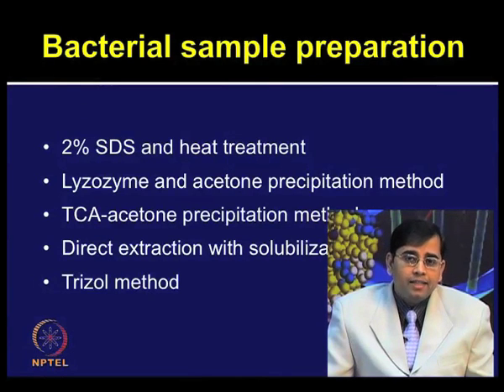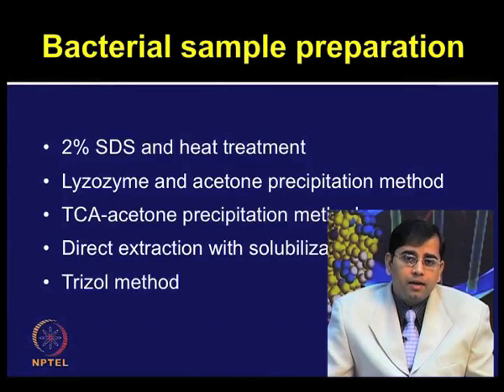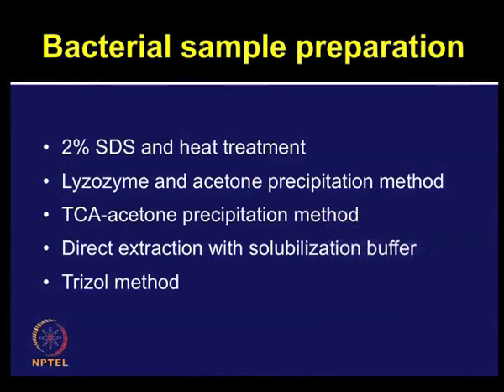Trichloroacetic acid and acetone together have been effectively used for precipitation, as has direct protein extraction and solubilization in the solubilization buffer. This strategy has also been used, and then the Trizol method has been used for bacterial sample preparation. I will elaborate on the Trizol method.